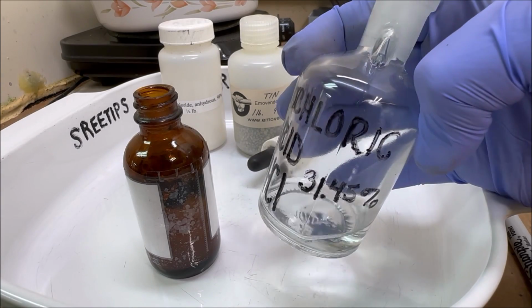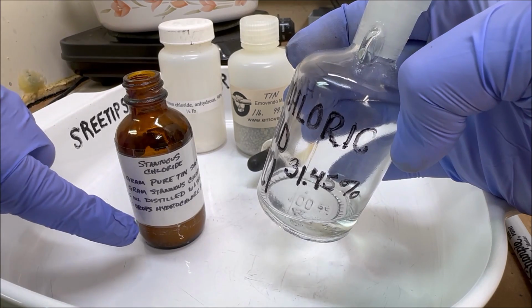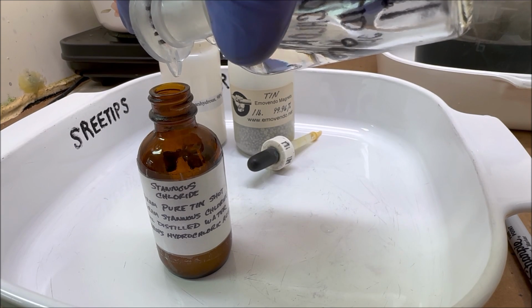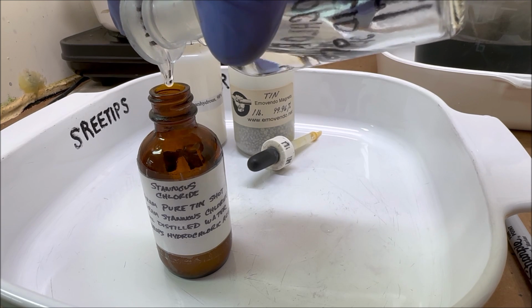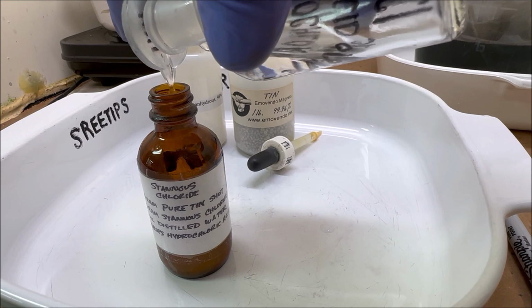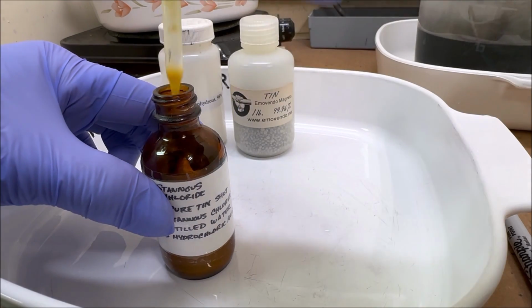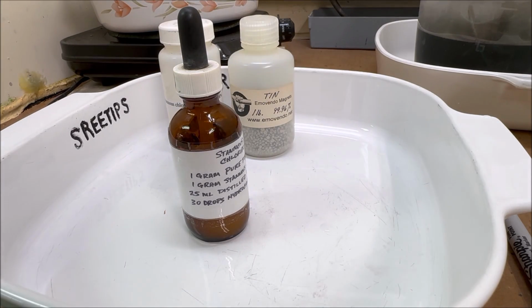Now I'll add hydrochloric acid. What does it call for here? 30 drops of hydrochloric acid. I'll add that right on in carefully. That's a couple extra, that's okay. I'll put the lid on, shake it up. That's ready for immediate use.